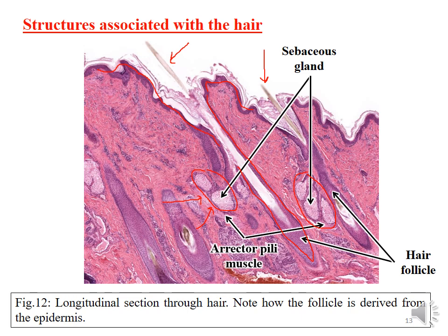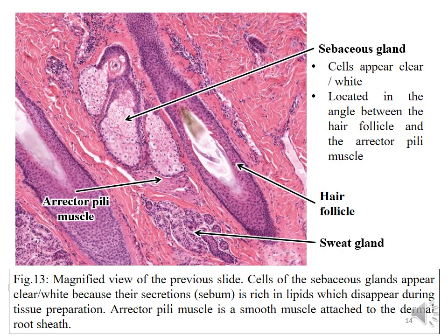So we'll take the same image and magnify it. This is a magnified view of the previous slide. Here is the hair follicle.